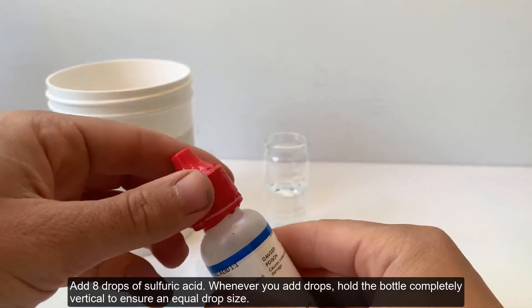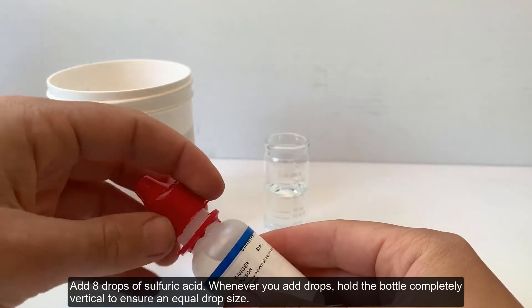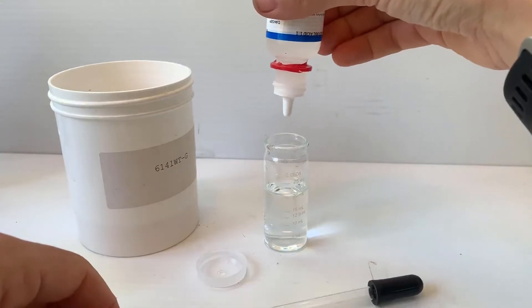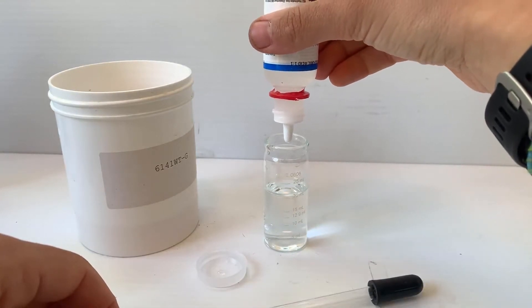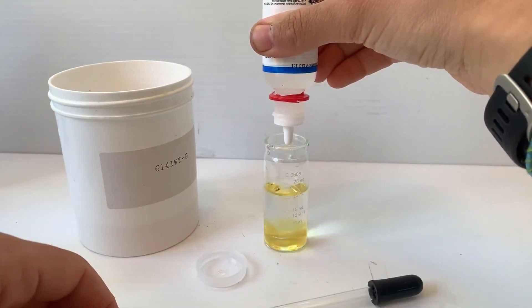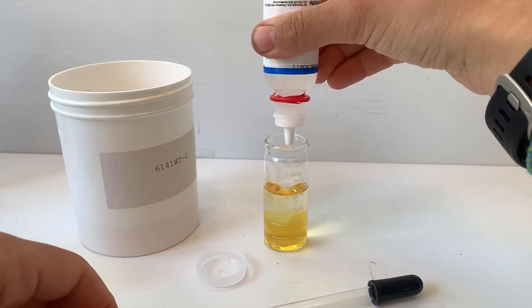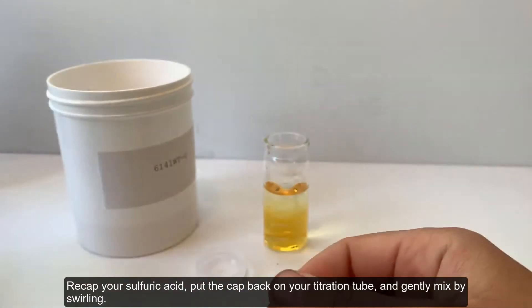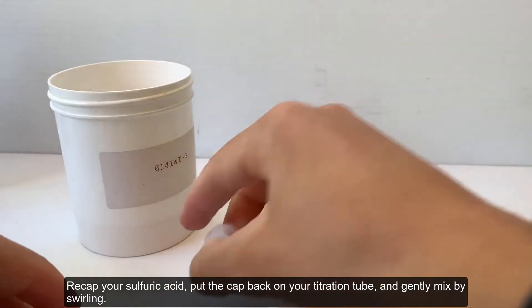Add 8 drops of sulfuric acid. Whenever you add drops, be sure to hold the bottle completely vertical to ensure an equal drop size. Recap your sulfuric acid, put the cap back on your titration tube, and gently mix by swirling.